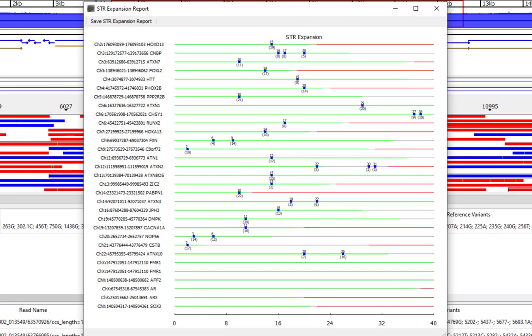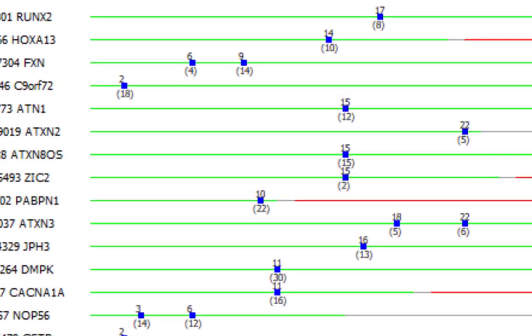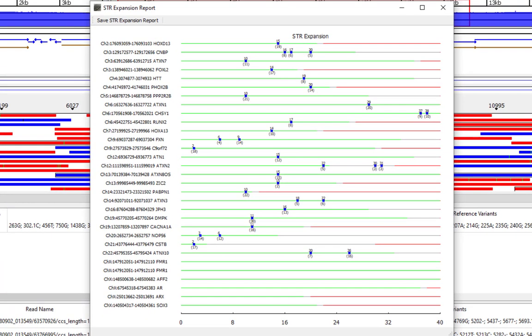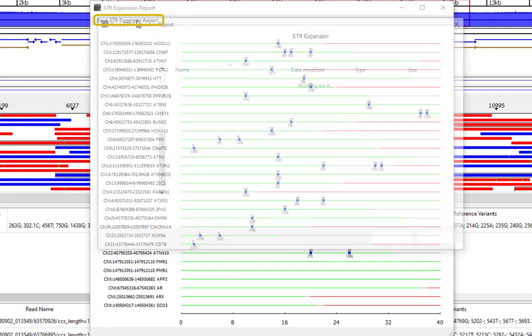For each locus, blue boxes show the repeat lengths detected in the sample. If multiple repeat lengths are found for a locus, there can be multiple blue boxes per line. For each blue box, the top number shows the repeat length and the bottom number shows the number of reads with this length. To save a text report for the repeat lengths of all loci, click Save STR Expansion Report.